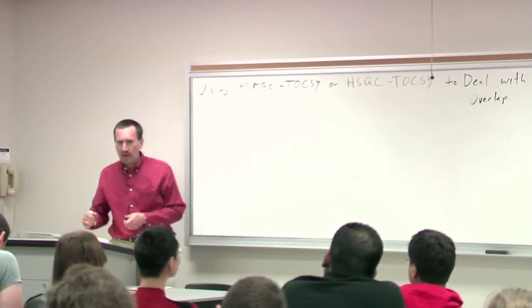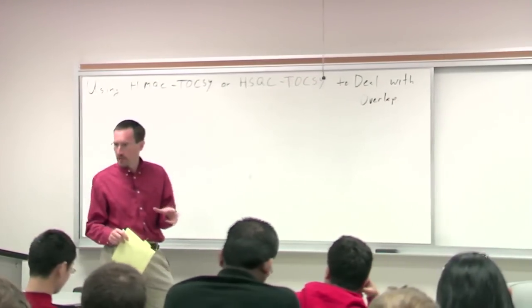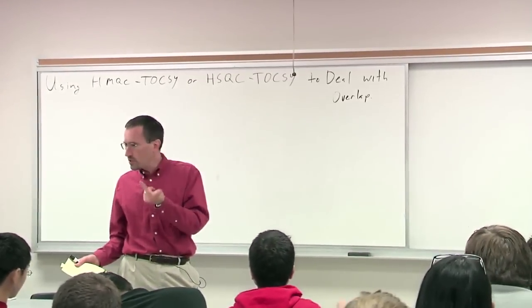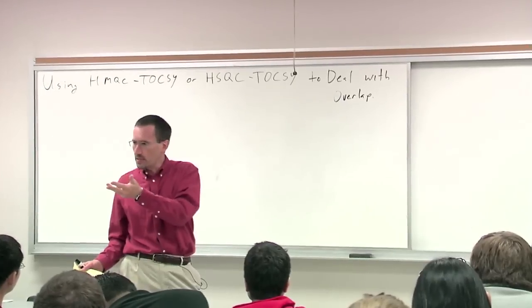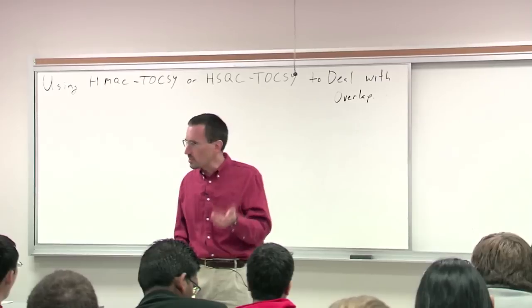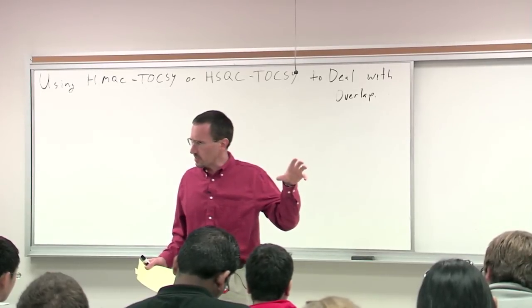When I first introduced just plain old TOCSY as part of our suite of four correlation experiments, remember I said we're going to take our core of correlation experiments as COSY, TOCSY, HMQC, HMBC. And then I said I don't want us to get overwhelmed in information and acronyms. So I said let's start with COSY and HMQC and use those as our basics for addressing 2D spectra.